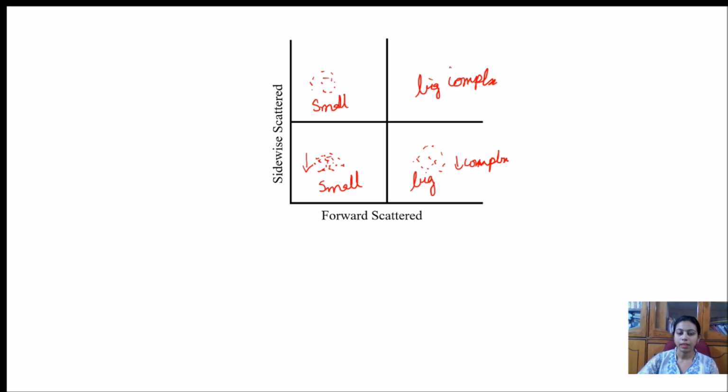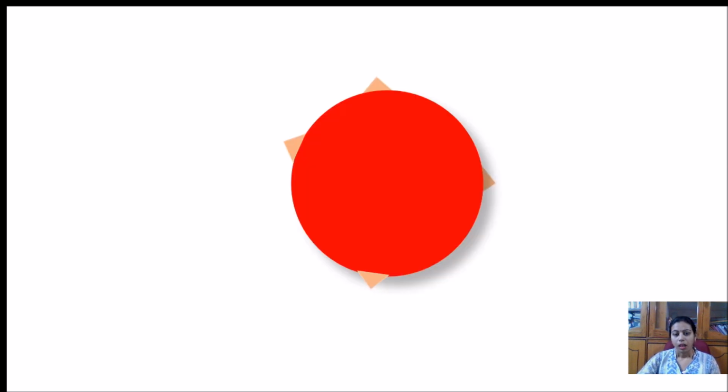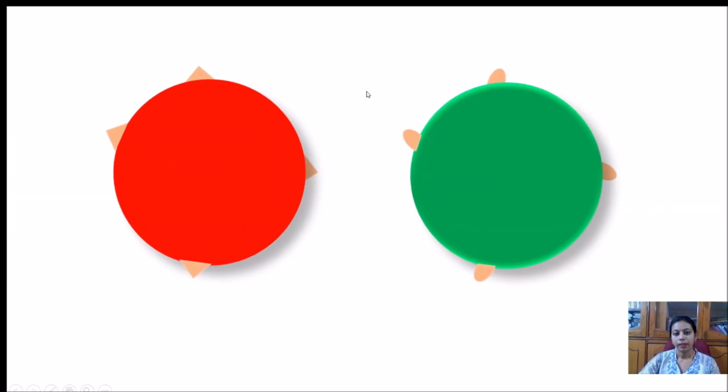Another thing which we can analyze using the FACS is that we can recognize different types of cells present in a group of cells. Wow, we can do that. Suppose we have cells having a certain marker over them, like some triangular type of markers, and there are other cells which have some oval type of markers.